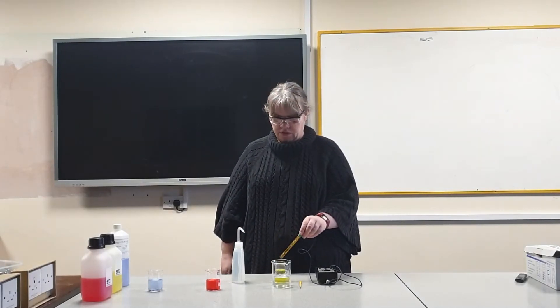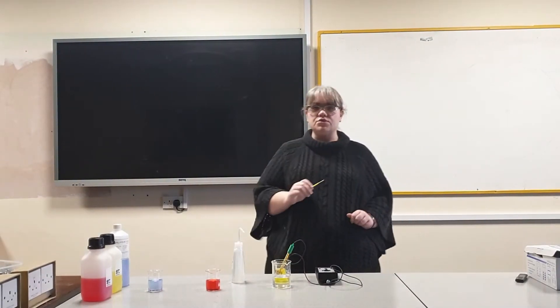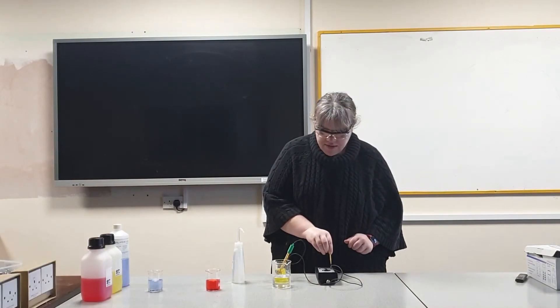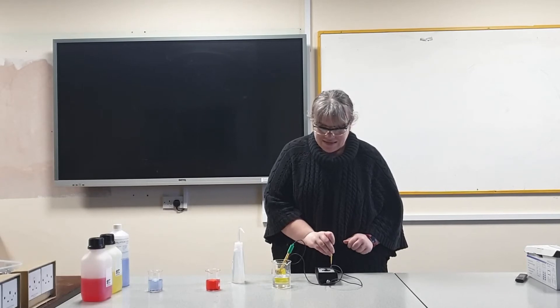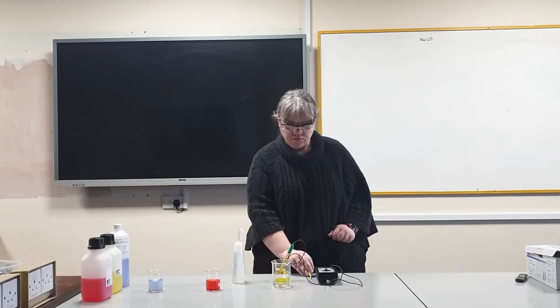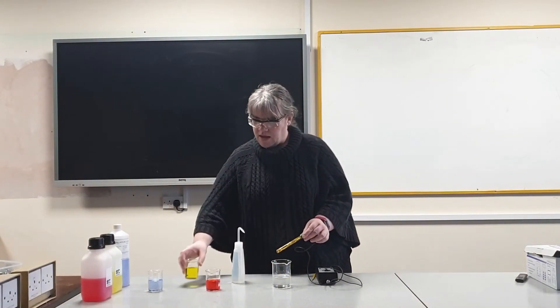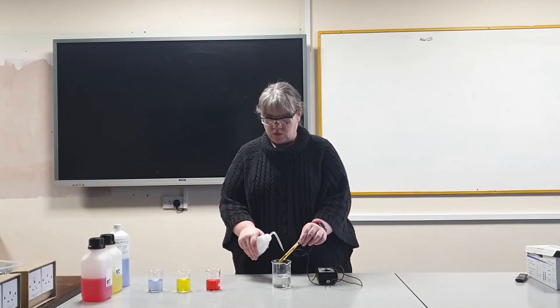I'm going to start with pH 7. Place the probe into the buffer and then using the small screwdriver adjust the calibration screw until the pH reads exactly 7. Once that's done remove the probe from the buffer and rinse with distilled water.